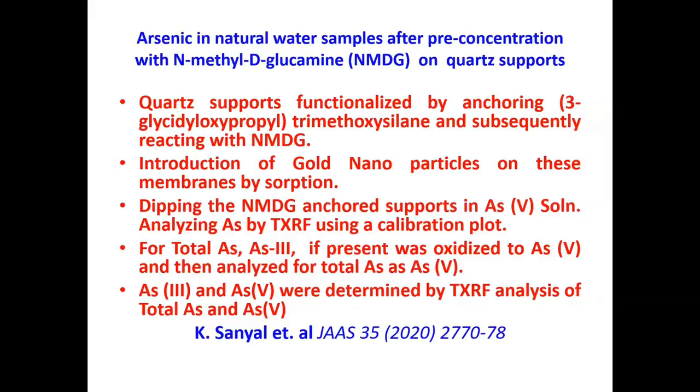There are other methods of quantification or speciation, where the species can be sorbed in a membrane deposited on the TXRF sample supports. In one of the studies in our group, quartz supports were silanized using 3-glycidyloxypropyl trimethoxysilane and subsequently reacted with NMDG. Then gold nanoparticles were sorbed in that. After that, it was dipped in arsenic-5 solution and arsenic-5 was sorbed and analyzed. Total arsenic was analyzed by oxidizing arsenic-3 to arsenic-5 and analyzing in the same manner. In this way, speciation of arsenic in groundwater was done.